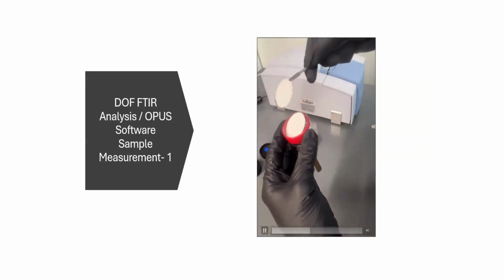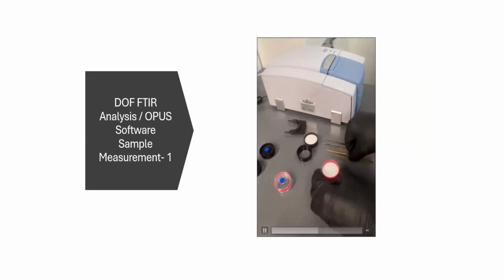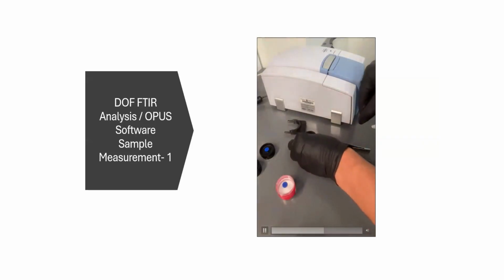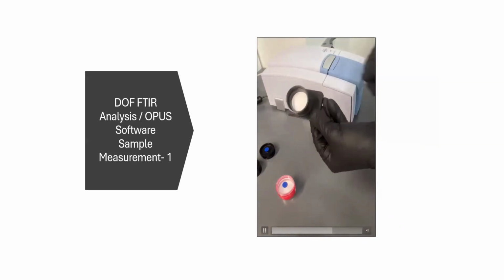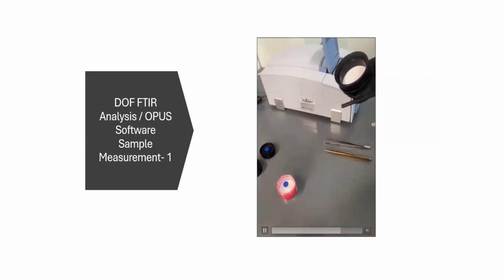You will need to separate the filter from the cellulose pad and then take only the filter, not the cellulose pad, out using another flat edge tweezer, touching very gently on the surface of the filter on the edge as much as possible, and placing it in the black cassette, and then inserting the cassette in the cradle.